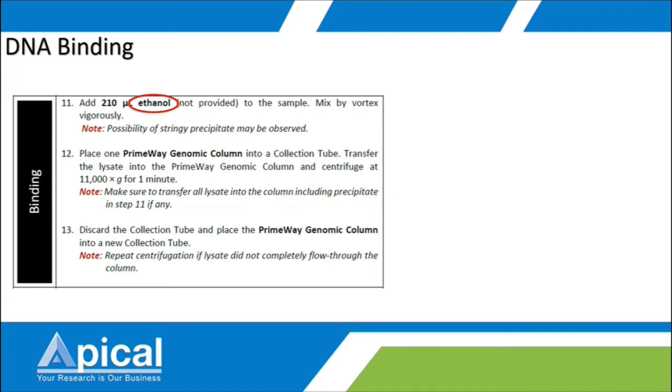You may ask me why, but I won't go into too much detail on the mechanism. It is a bit difficult to explain, but just a simple version: DNA is hydrophilic, right? So it will form a hydration shell in the water.